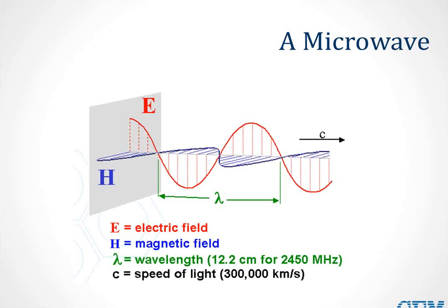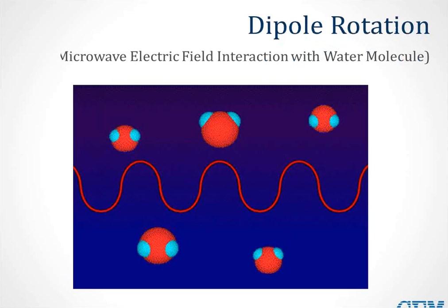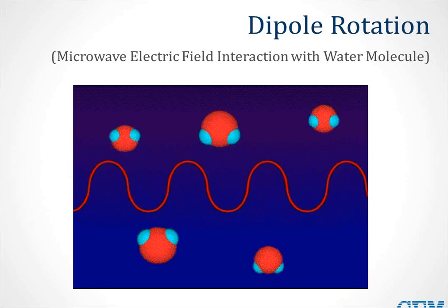And what you'll notice if you've ever looked at a Discover SP is that the inside of the cavity is right about 12 centimeters, and that's by design to be the size of about one microwave. And the reason for the selection of this particular frequency, many people commonly think that this is due to the fact that it's what heats water best, but actually there are certain frequencies allowed for us to use by the FCC, and 2450 happens to work pretty well for most of our samples. And because they're used in your home microwaves, the magnetrons are fairly inexpensive, and we're able to pass that savings on to the customer. So there are two different mechanisms by which microwaves heat a sample.